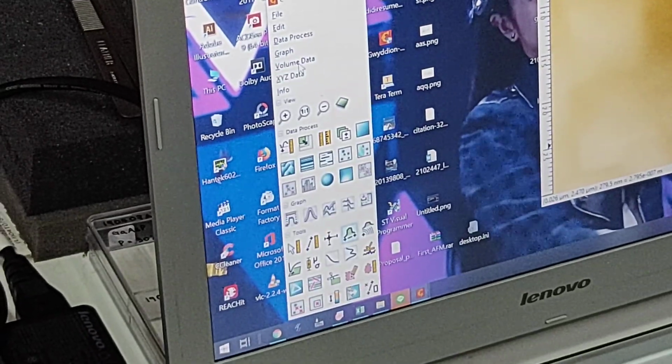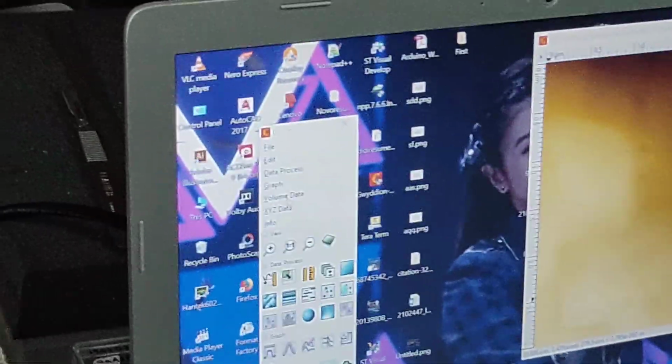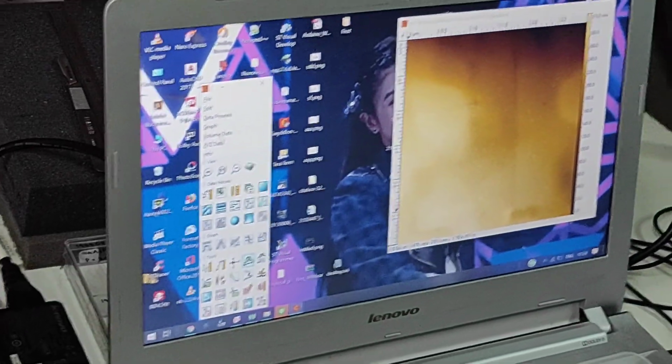Why? That is the trial version. It's a free program. Why can I not see it?